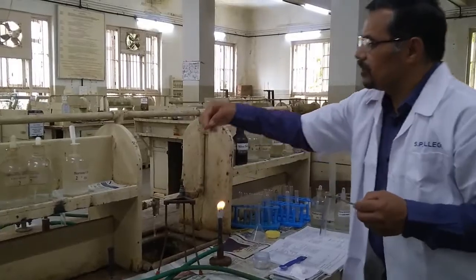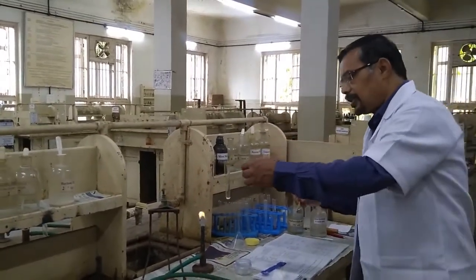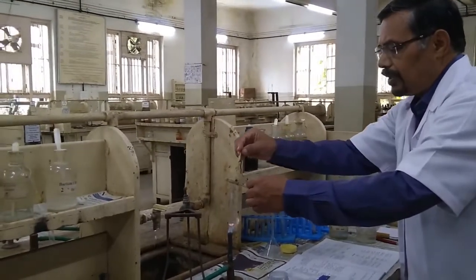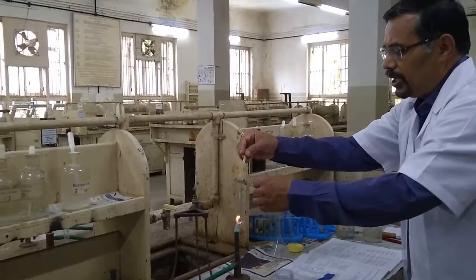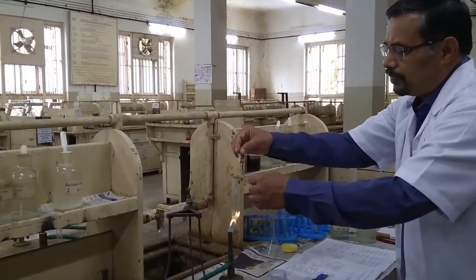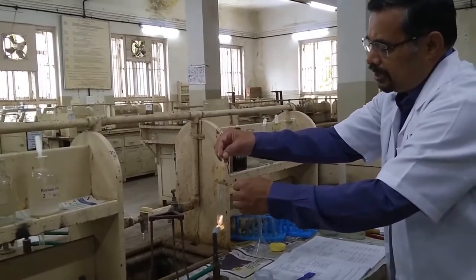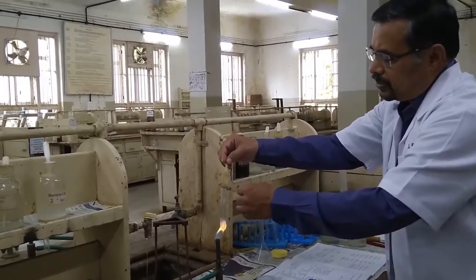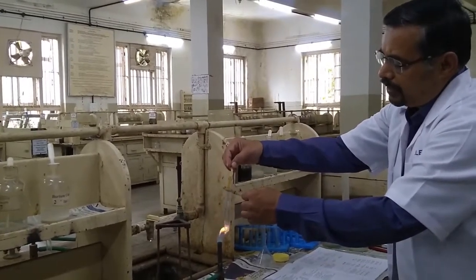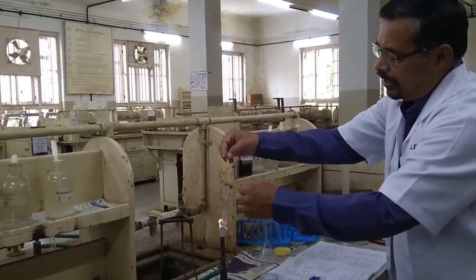Now this is moist turmeric paper. I will heat this test tube and at the same time I will hold this moist turmeric paper on the mouth of this test tube. See the color change of this turmeric paper.